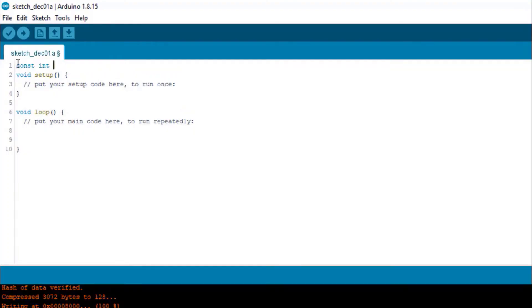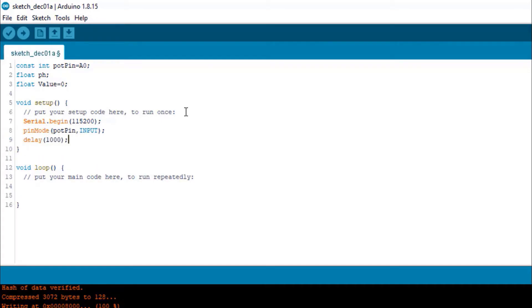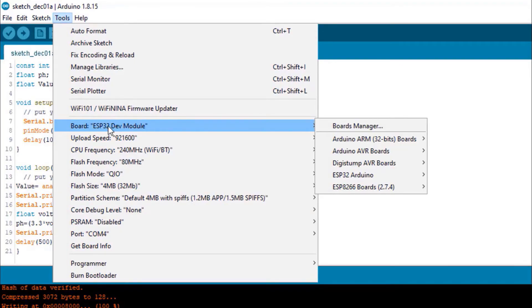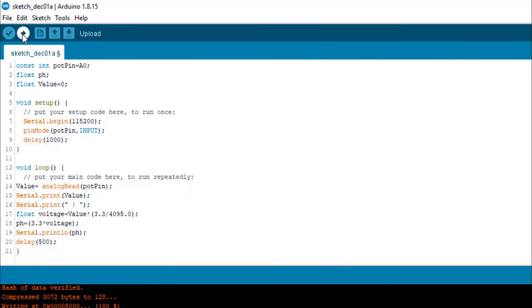Now let's move to the basic code. We will only be measuring the analog-to-digital converter value and then converting it into a pH value. So this is a simple code according to the datasheet. Now select the ESP32 board from the list, then select the port as well, and then you can upload the code.